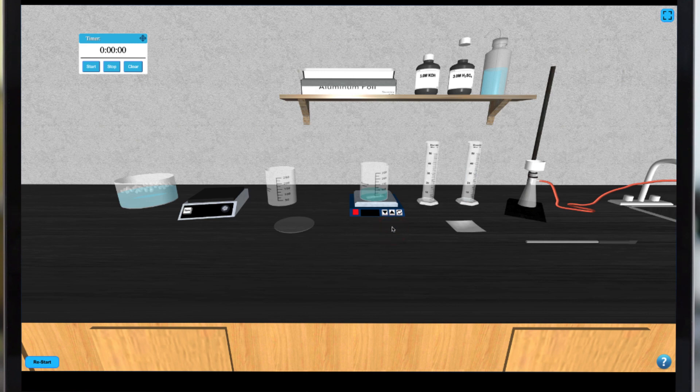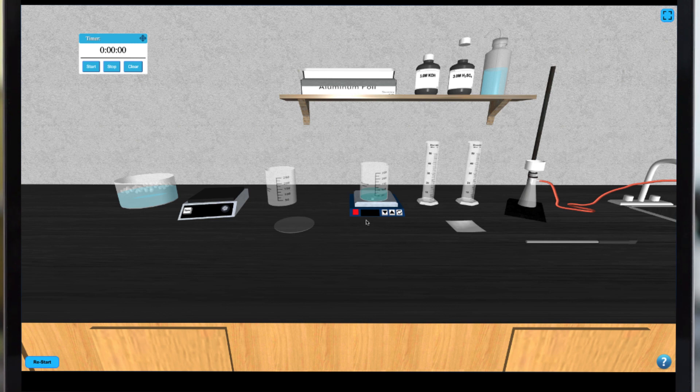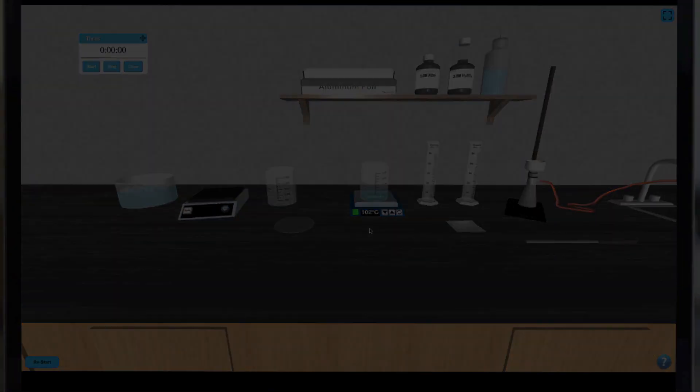Now you can turn on the heat by clicking the red button on the hotplate to let your sample come to a boil. Once the boil is complete you can place your beaker on the bench top to cool slightly before immersing it in an ice bath.